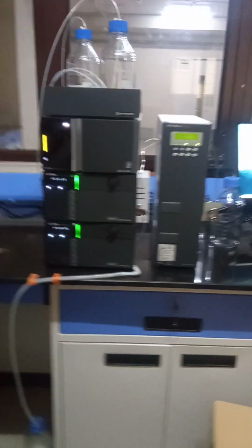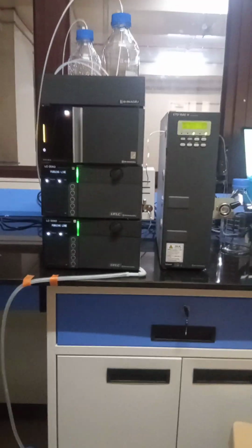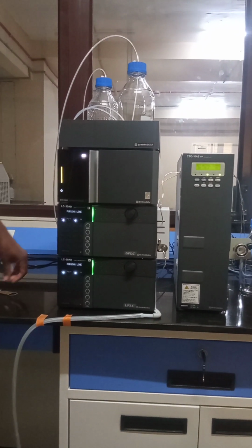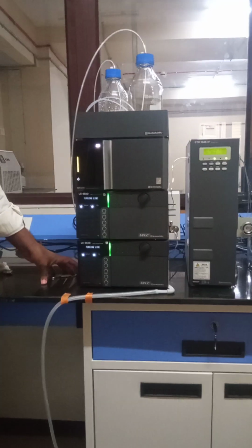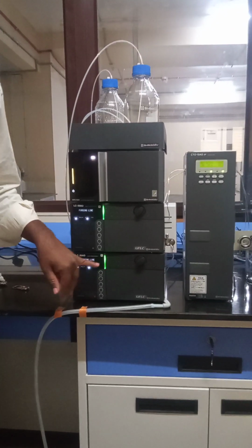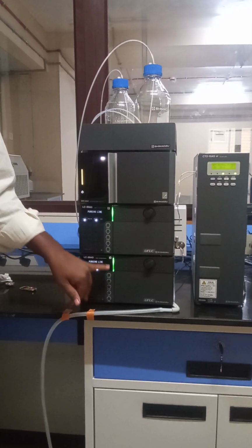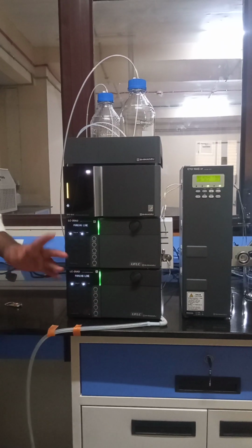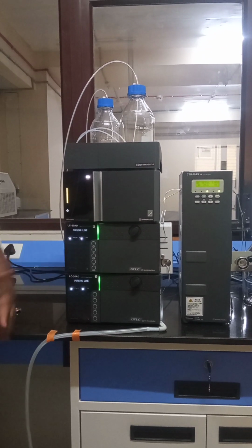Press pump A and pump B, both. Then close the purge valve and press the pump A button and pump B button.